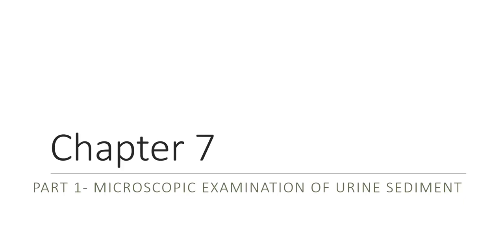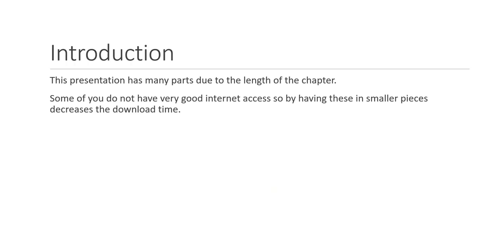Welcome to Chapter 7, Part 1, Microscopic Examination of Urine Sediment. This presentation is broken down into many parts due to the length of the chapter. Some of you don't have very good internet access, so having these in smaller pieces decreases the download time.